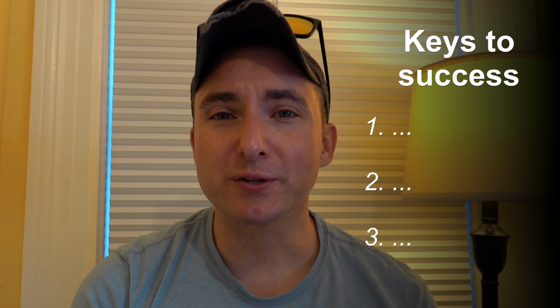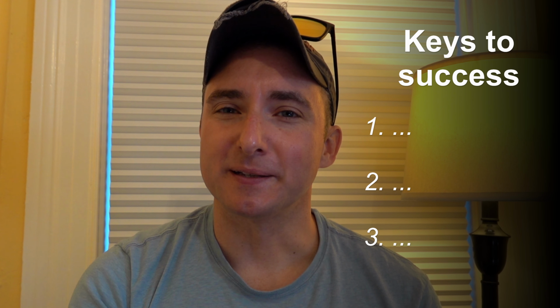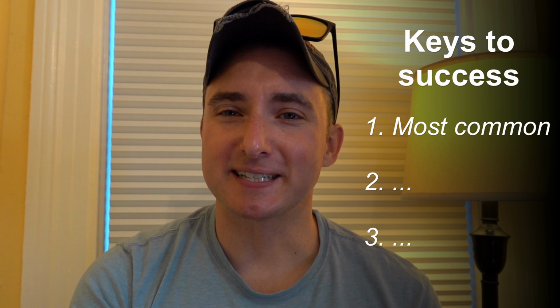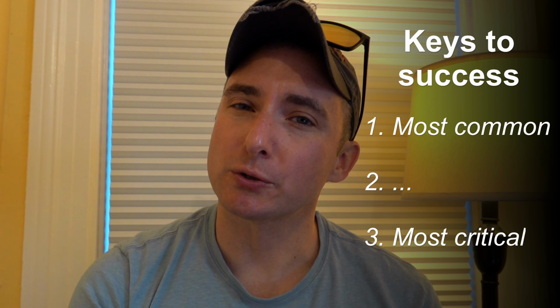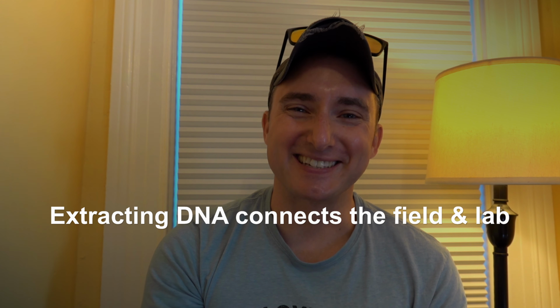So what I'm going to do is show you these 3 simple steps, and I'm going to go through them from the most common mistakes that I see happening in the lab to the most critical. If we're just talking about extracting DNA, if we're just talking about those critical first steps to the connection between the field and the lab, can you guess what these techniques are?